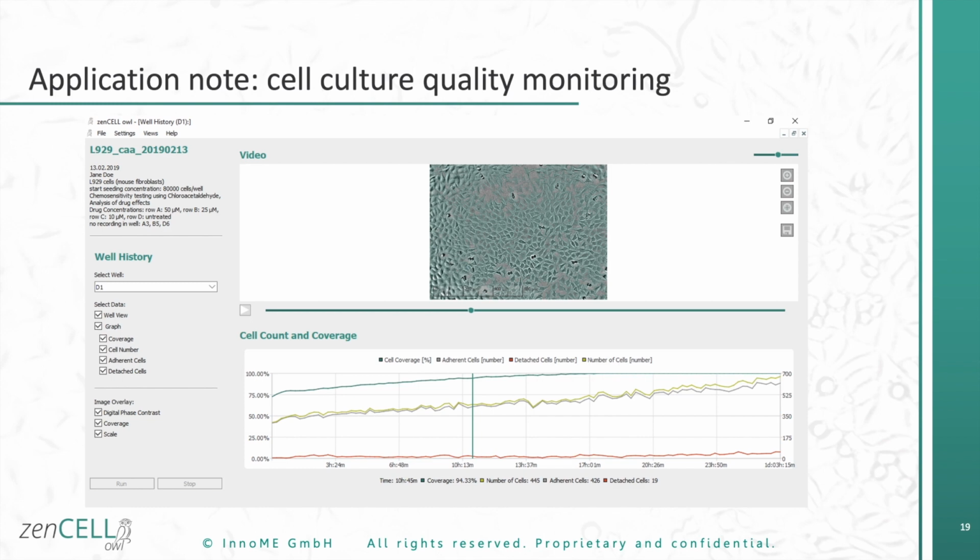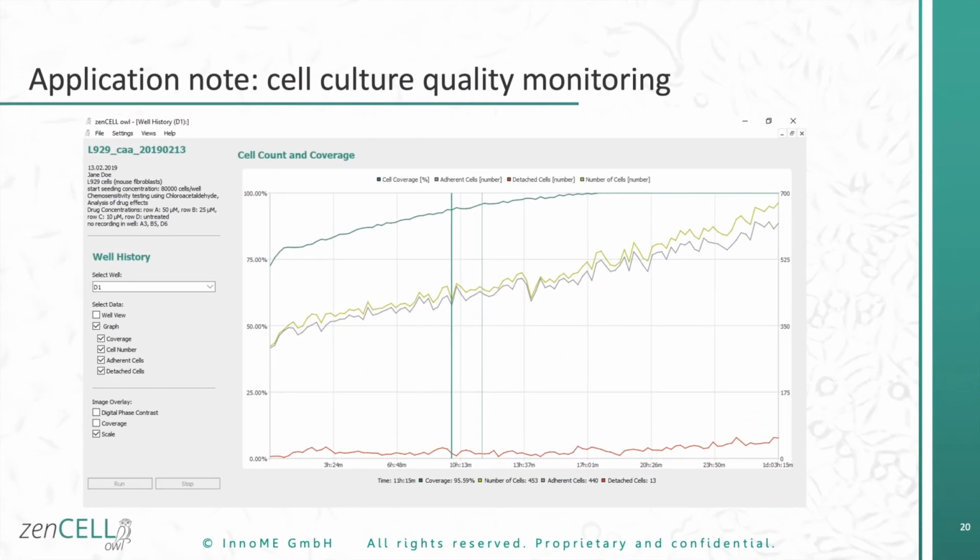And this can be visualized in a plot below the image/video. You can also separately analyze the data from the image analysis algorithms. You can also export this from the software to use this as a tool to describe your processes and compare your processes between different experiment runs.